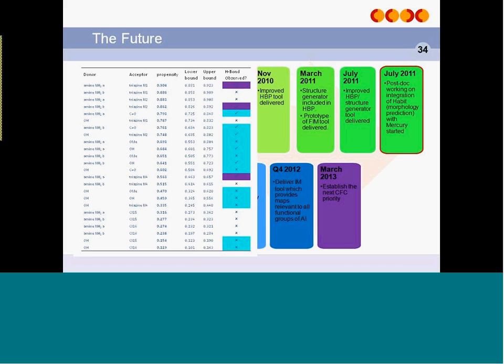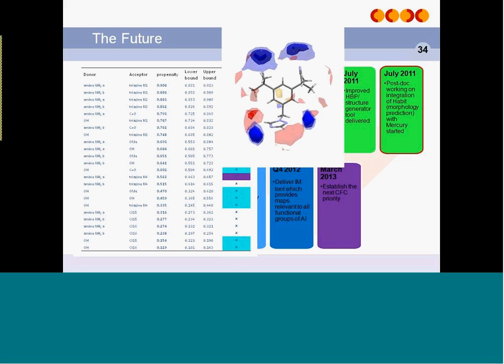So we're looking at how we could automate, say, in silico co-crystal screening, for example, or interaction with solvents.